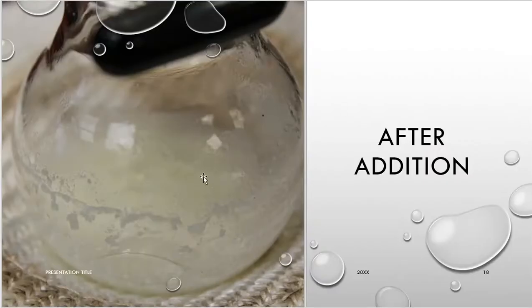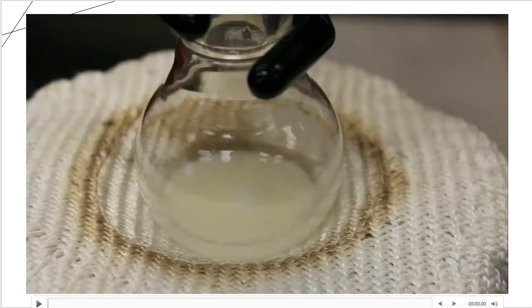All right, so here's a close-up of after the addition has taken place with the acetic anhydride from the separatory funnel. This is just a closer picture of what's happening inside of the boiling flask. So notice this foam that is around the flask. The solution has this milky color, almost kind of going on the verge of a beige color for the solution. It's also very cloudy. I can't see through it anymore. So it's a very good sign that a reaction is taking place.